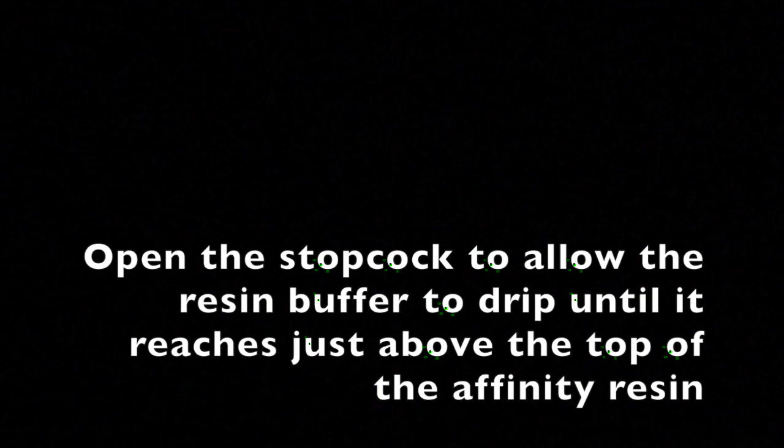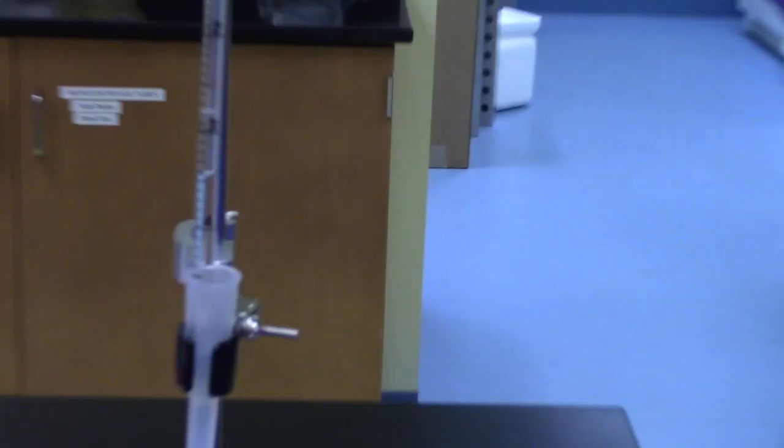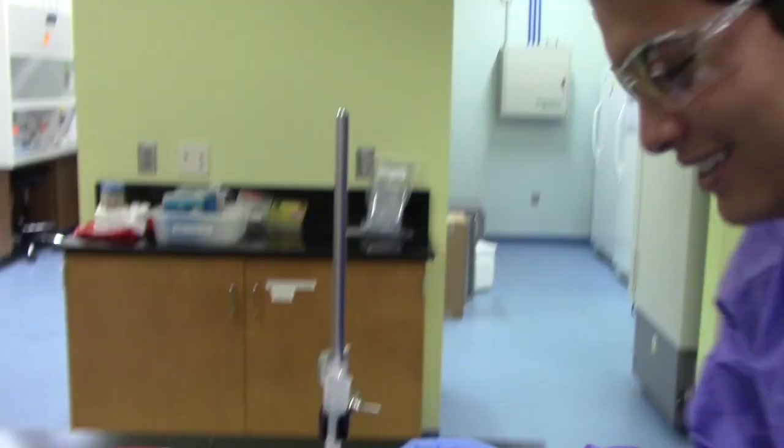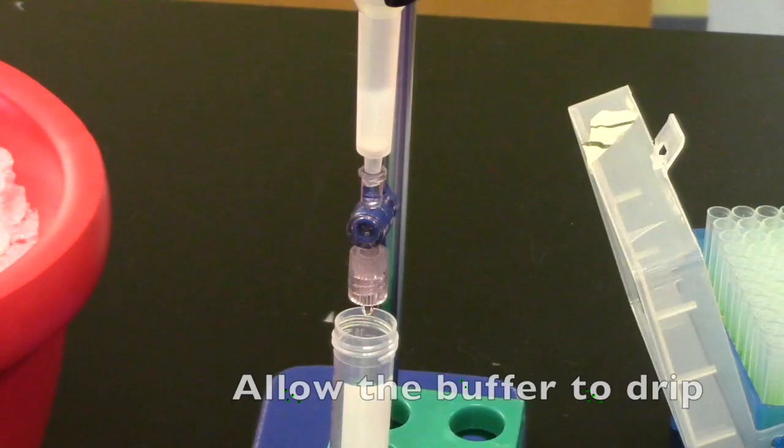Open the stopcock to allow the resin buffer to drip until it reaches just above the top of the affinity resin. Add the bind wash buffer. Allow the buffer to drip until it reaches the top of the resin bed.